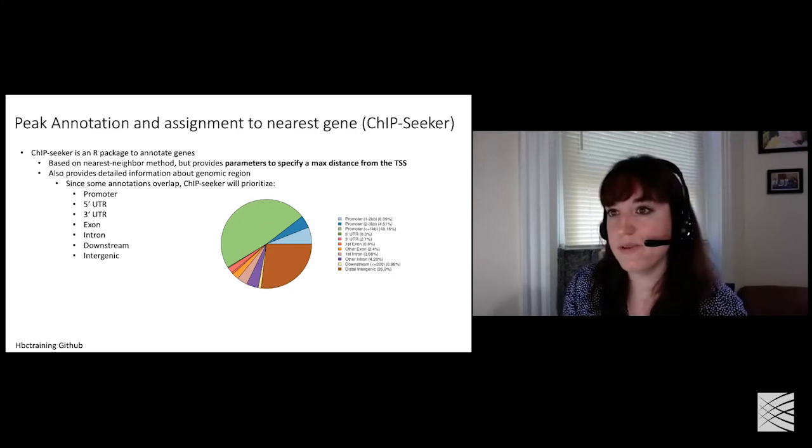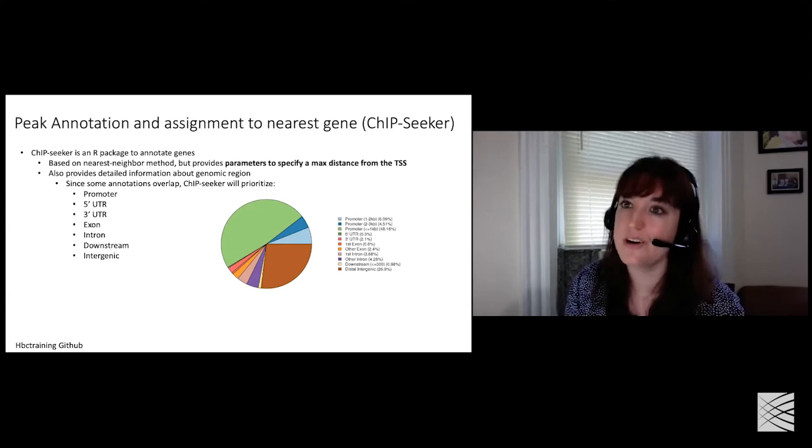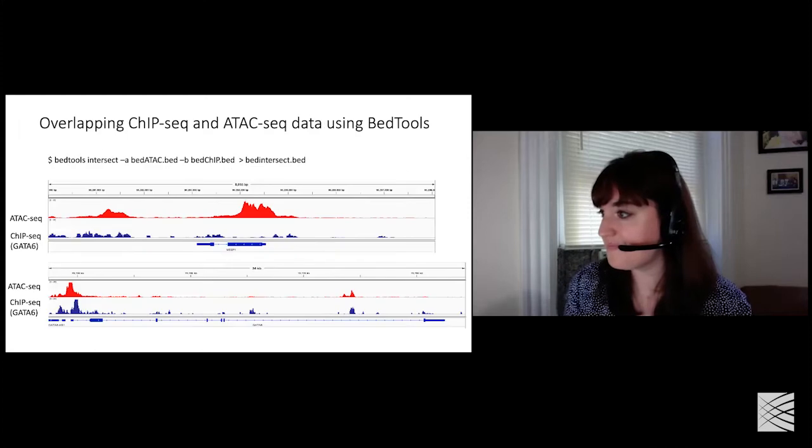It's kind of one of the reasons I like this annotation program too. It's really specific about where in the genome it's located, which exon or which intron, or literally the distance in base pairs from the transcriptional start site. So that's why I use this program.